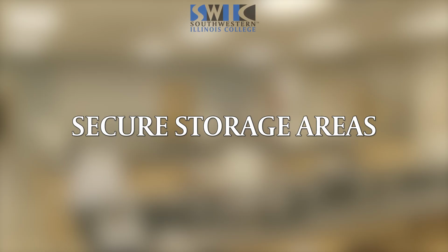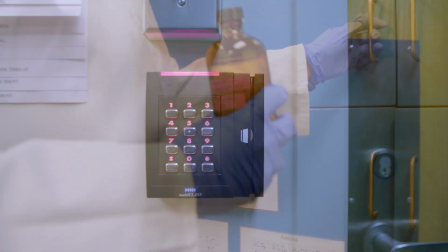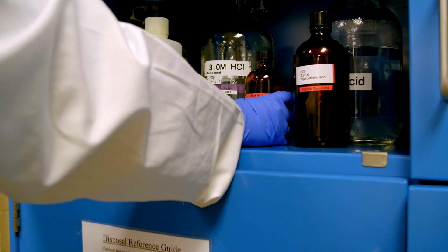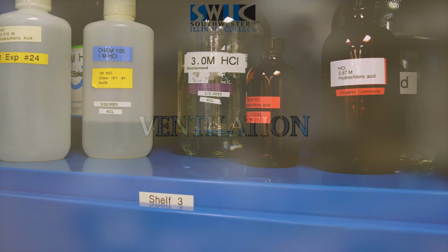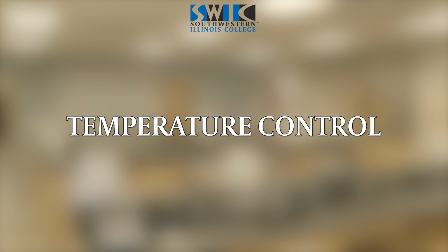Use designated storage areas for your chemicals. This might include safety cabinets or storage rooms with controlled access. Lock them up when not in use to prevent unauthorized access. Maintain proper ventilation in your storage areas. Good airflow helps prevent the buildup of fumes and reduces the risk of inhalation hazards. Pay attention to temperature. Some chemicals require specific storage temperatures to remain stable and safe. Make sure to follow these guidelines. They can be found on the SDS or on the bottles sent by the manufacturer.